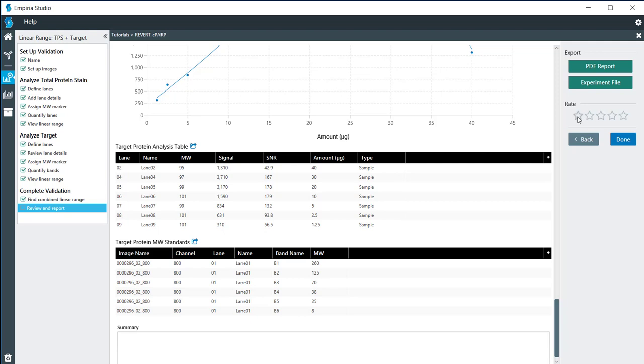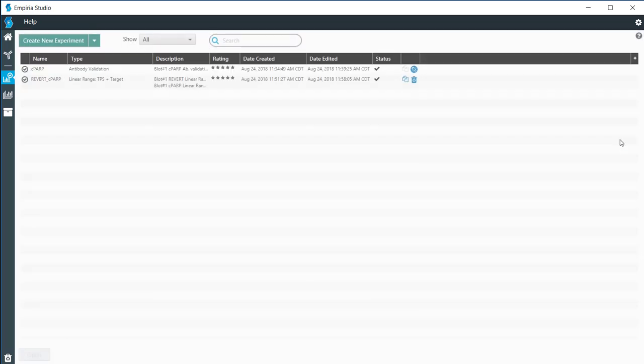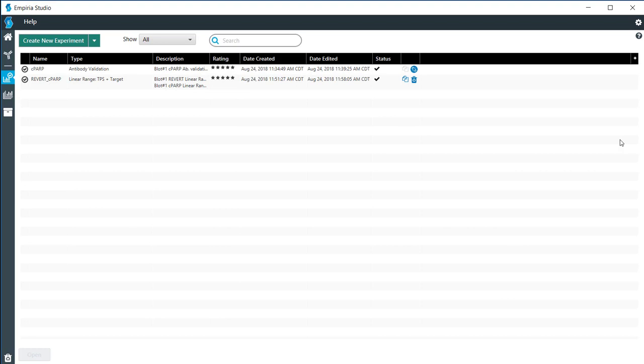You can also rate the experiments. If everything looks exactly the way that you want and it's a good experiment, you can click on 5 stars and then click done. Thank you.